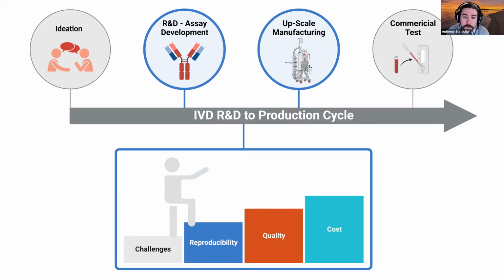It could be the case that over many decades of a hybridoma living in a freezer, the hybridoma may have experienced some genetic drift. There could be a loss of performance due to other contaminations within that hybridoma cell line. Nonetheless, access to the same monoclonal antibody that you had some time ago is no longer present.